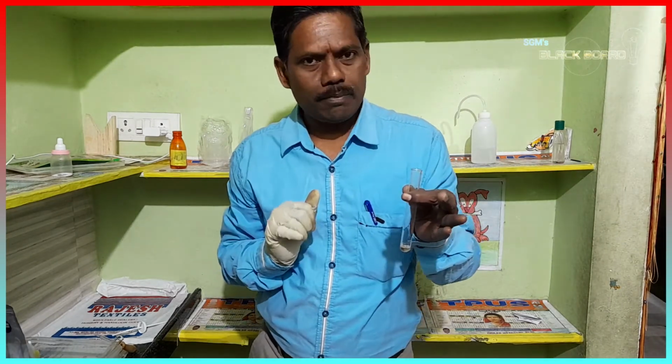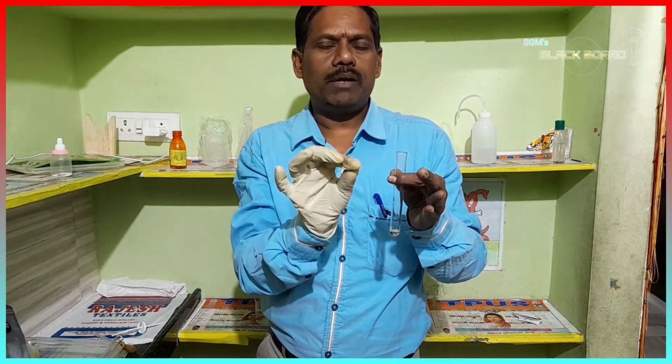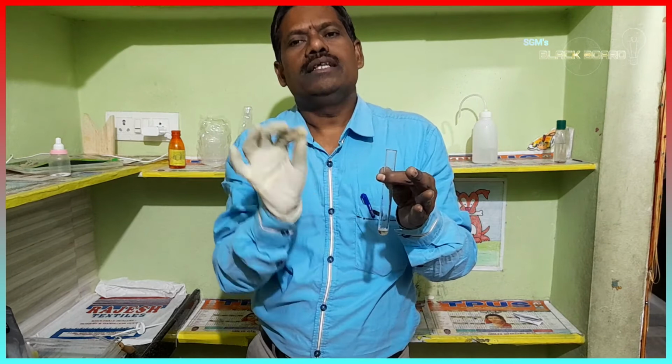We know that hydrochloric acid turns blue litmus red. But here, when this gas evolved, the dry blue litmus paper did not turn red. When I put a wet litmus paper in front of it, the blue litmus paper turned red.